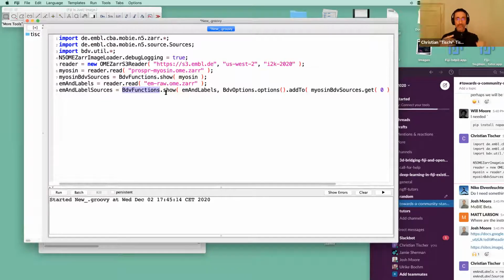It's really a viewer that's based on a physical coordinate system and not on a voxel grid coordinate system. So very different concept than the ImageJ1 viewer. So BDV is really good. It just wants to know where a pixel belongs in physical space. And then it can show all kinds of things on top of each other. That's why it's really great for this kind of thing. And you don't have to upscale or downscale data.